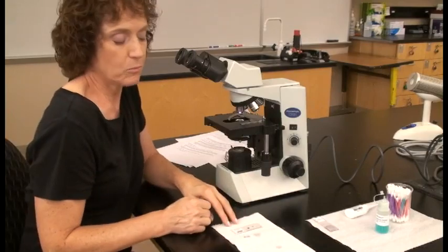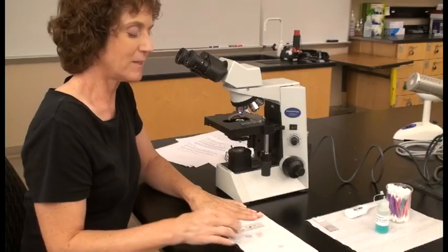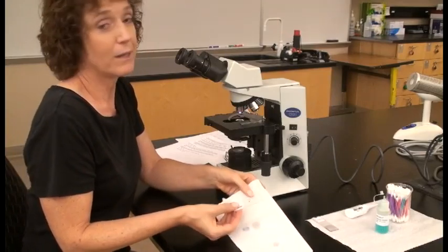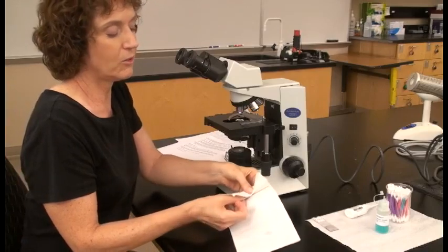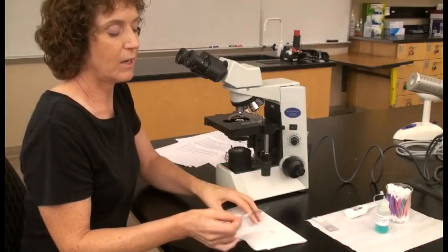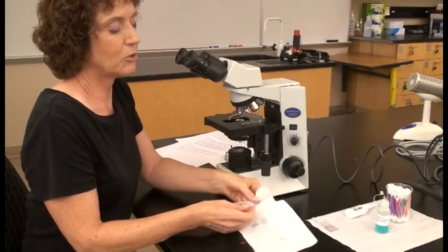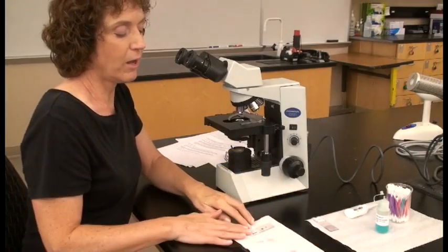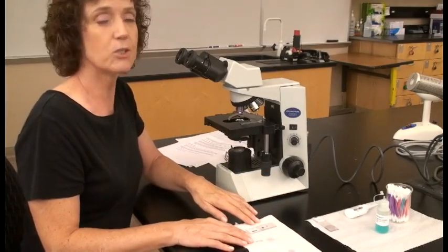Having the slide flat on the table helps you avoid breaking it. If you hold it in the air and scrape, there's a chance you'll be stronger than you think and break the slide. If it's on the table, there's no way to break it unless you use a hammer.